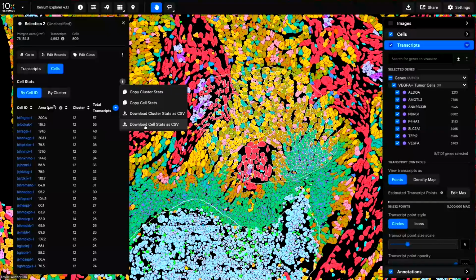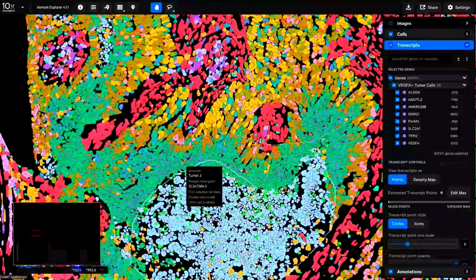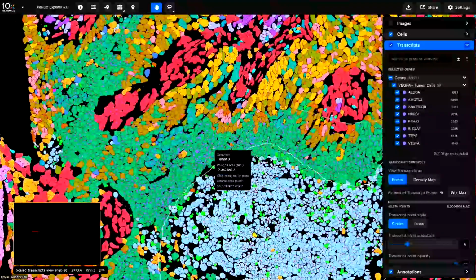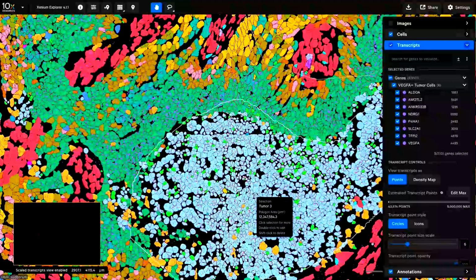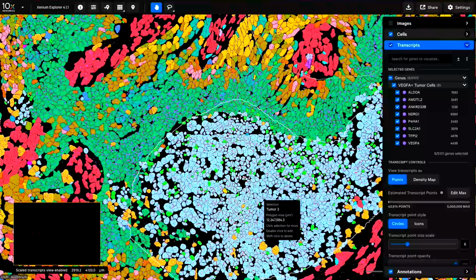And because there is no sequencing, the data is available pretty much at the end of the run. And at any point, you can always look at the original web summary file. So let's say we know that those necrotic regions are populated by those light blue cells.